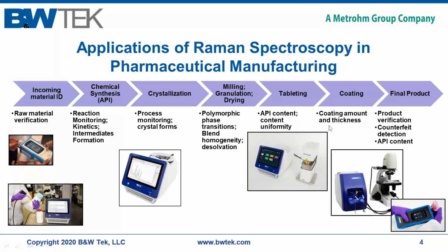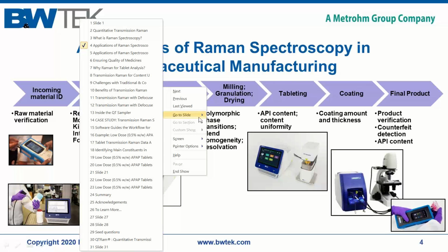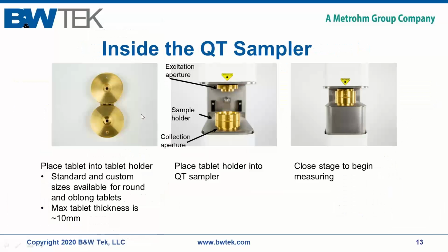Do you have a universal or adjustable tablet holder? The tablet holders that we have, the round one is of a set dimension. Unfortunately, I did not include a picture of the oblong one. The oblong one can accommodate different sample sizes and dimensions. Here, of course, you could have something smaller as long as it's larger than the hole on here. But these can be made, and we do have a set. We do have different dimensions available, but they can also be customized.